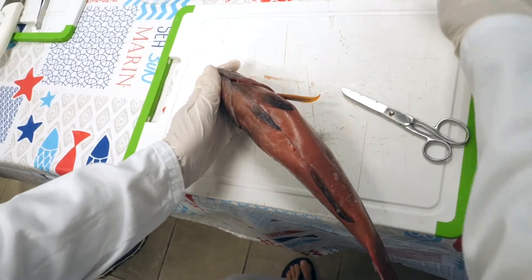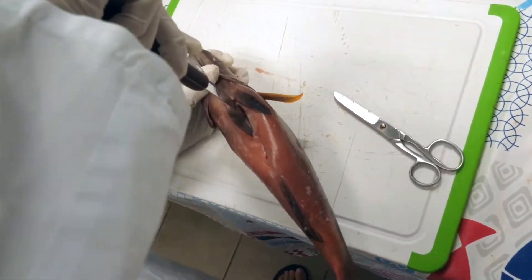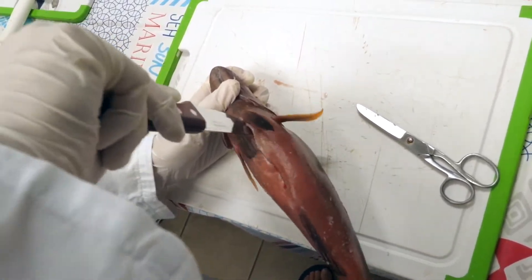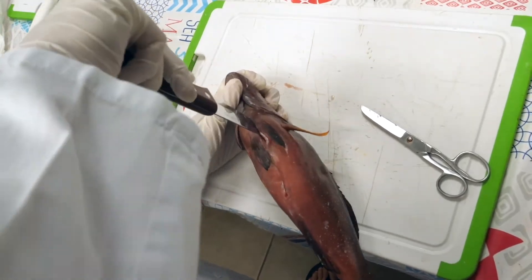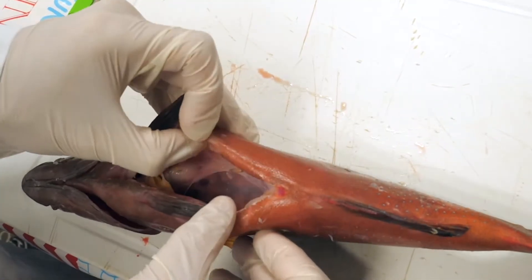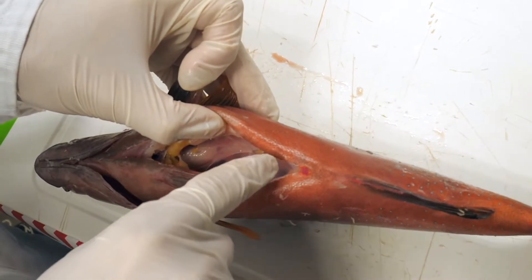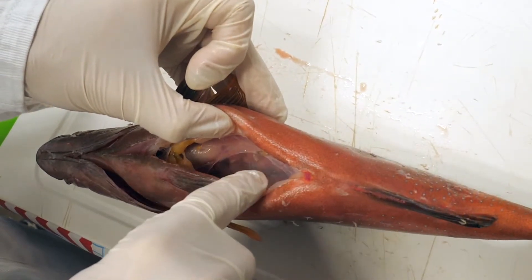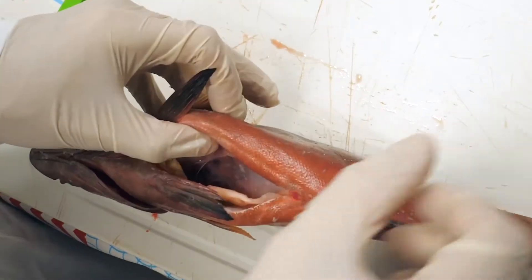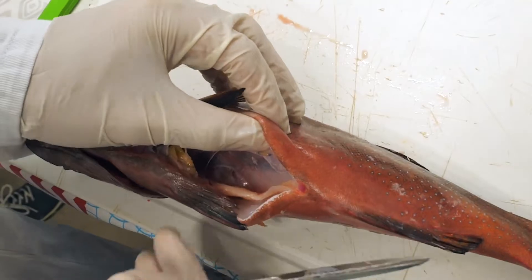The pectoral fin section is generally sturdier. To work with it, use a strong pair of scissors or a serrated knife. After making the incision, locate the gonads. They are located in the lower part of the abdominal cavity, connected to the anus, and generally under the intestines and attached to the swim bladder.